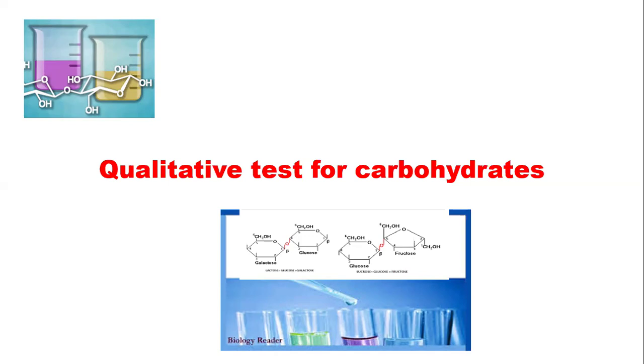What we are going to be discussing here, we are not going to talk about the procedures because you have already done that in the laboratory. So here, basically what we will discuss is the principle regarding each test. Each of the tests that we are going to discuss, we are going to strictly discuss the principle and the reagents that are involved in the test, and also the reaction, and also the observation of colors that will be seen at the end of the experiment.